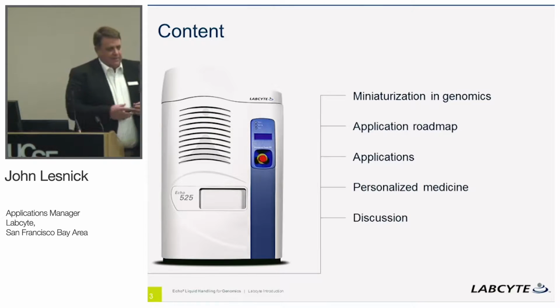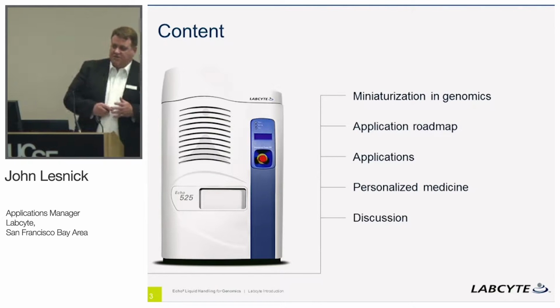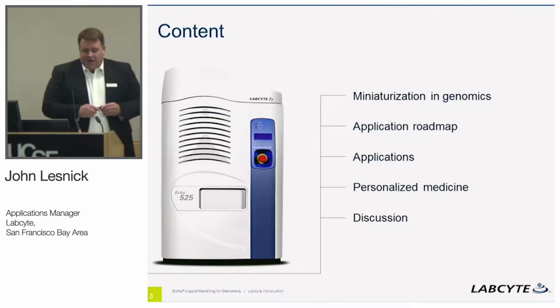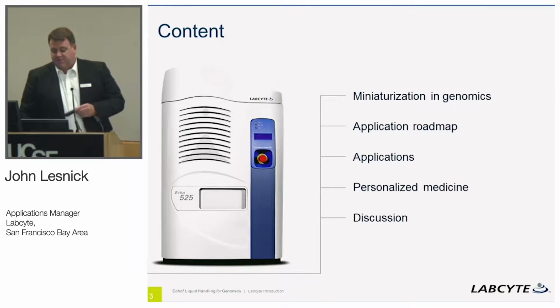Speaking more specifically about applications, I'm going to take some time to detail a few in the genomic space. I'll touch on what else we can do only briefly. In those genomic applications, as Chris mentioned, it's going to be synthetic biology, genotyping, as well as NGS library prep. Then I'll finish with a highlight feature: Christopher Winneberger at FIM, whom Chris already brought up, and how he's using the Echo towards personalized medicine. And we can open up for discussion.